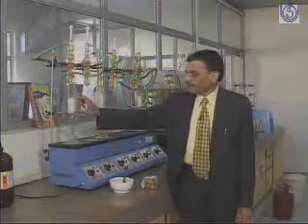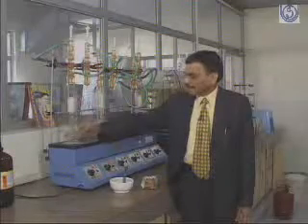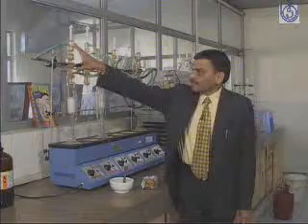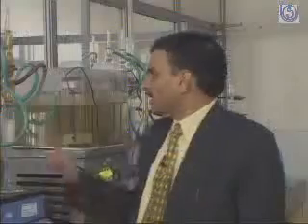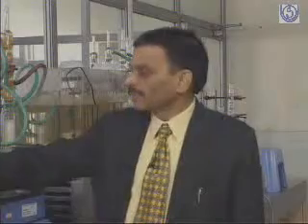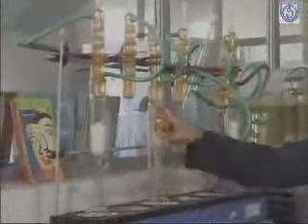So we put the sample in this white color thimble, and ether is put into this flask, and the condenser is put over this soxlet extractor. Then we set a certain temperature. This water is circulated through the condenser, so ether is cooled, and this ether is circulated again and again.